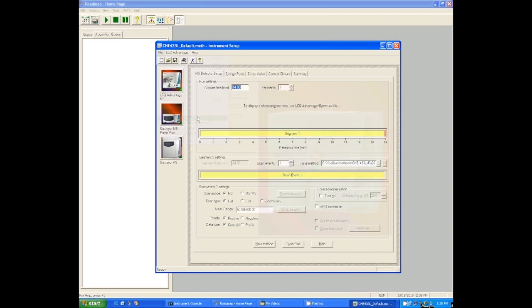Now these mass spectrometer parameters are going to be a lot more complicated than the mass spectrometer parameters were on the GCMS, because there's a lot more that you can do with this mass spectrometer. It's an ion trap we're going to use similar to how toxicologists use triple quad.